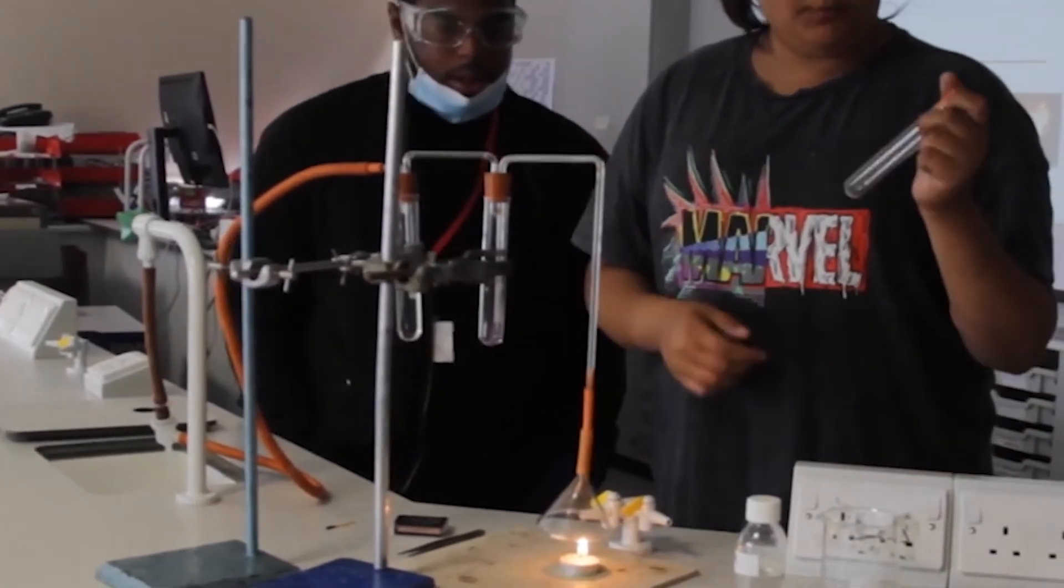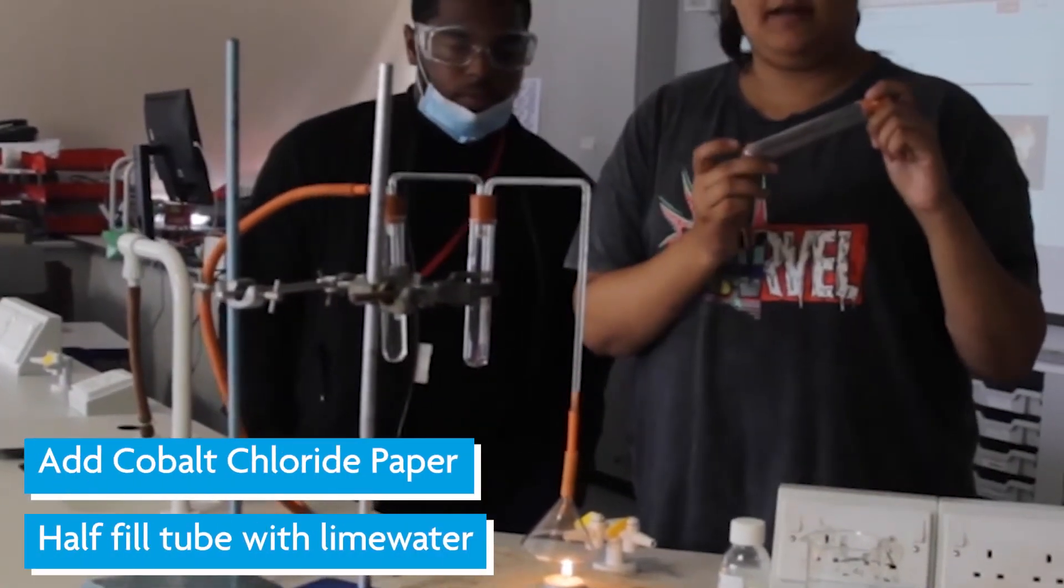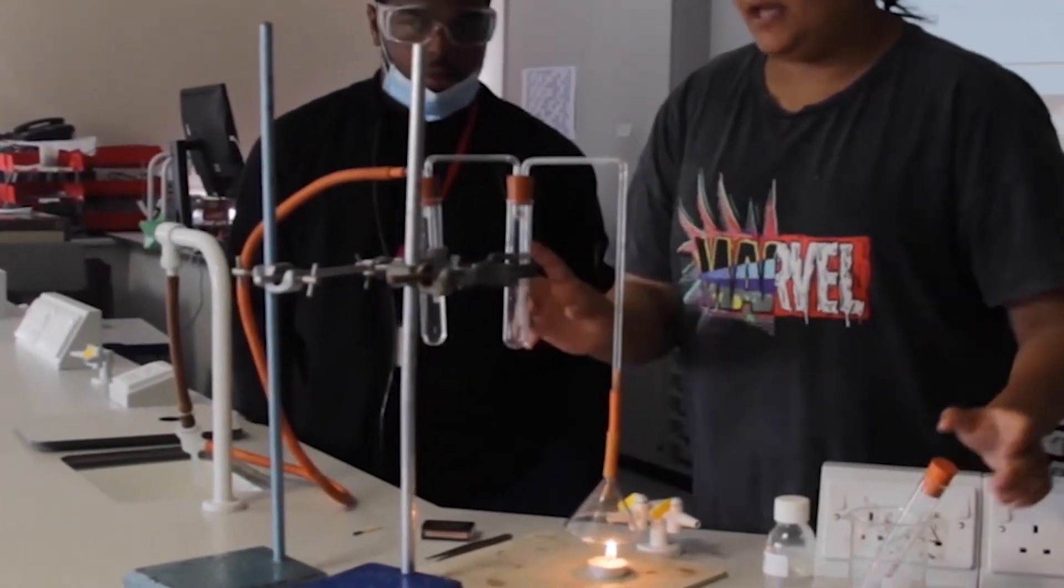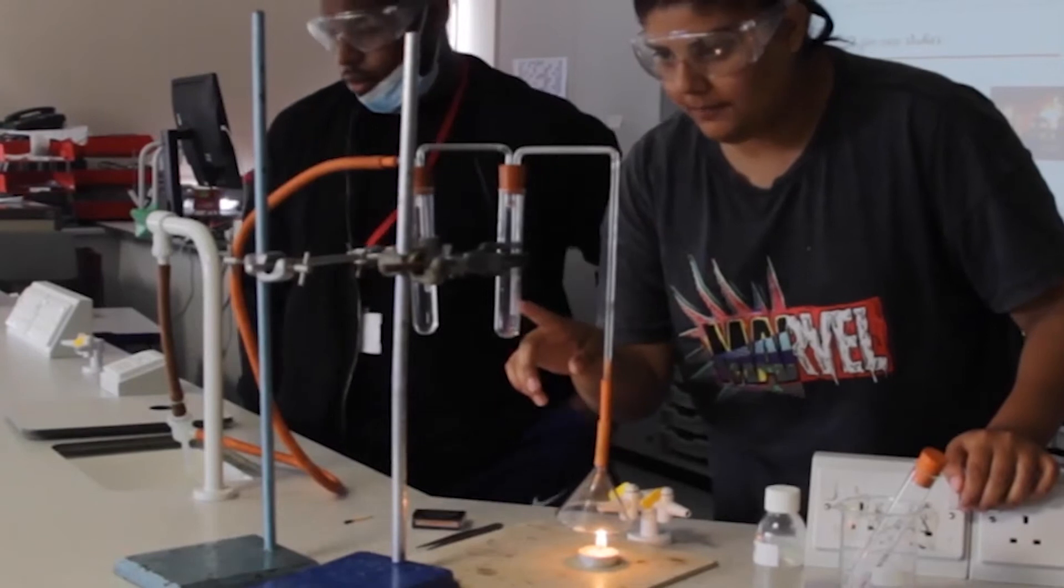To find that we are going to use cobalt chloride paper as you can see over here, which is purple. To investigate if water is present, over here you can see there is cobalt chloride paper in the tube.